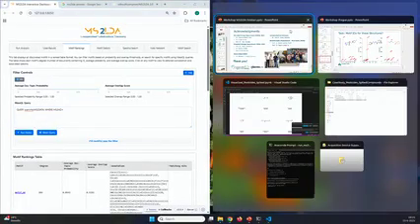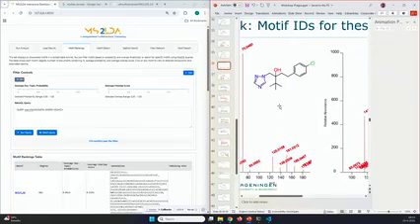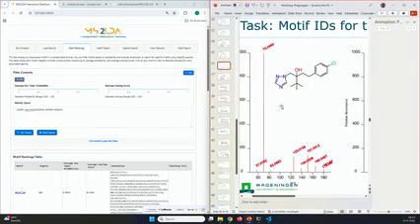This will now be a little bit of jumping, but the easiest way is, let's say you suspect to have this structure in your data set, and you want to see, do I have a substructure that's related to this structure? Then the easiest way is always to check what are really dominant fragments in the spectra, and just search for them.